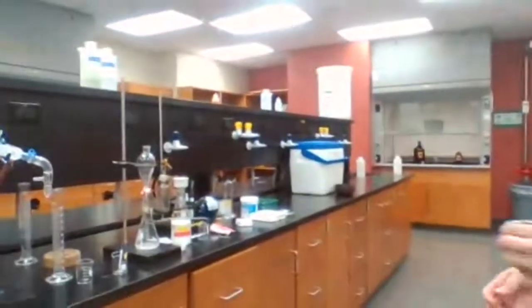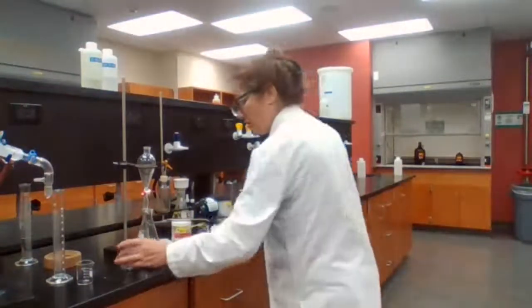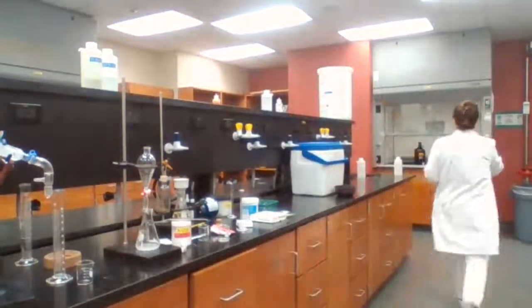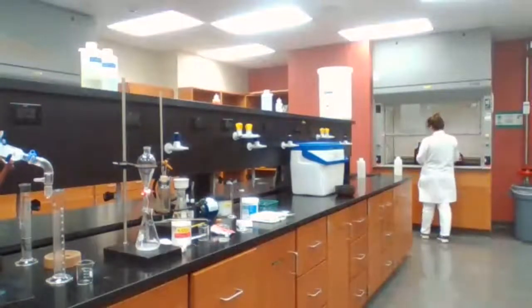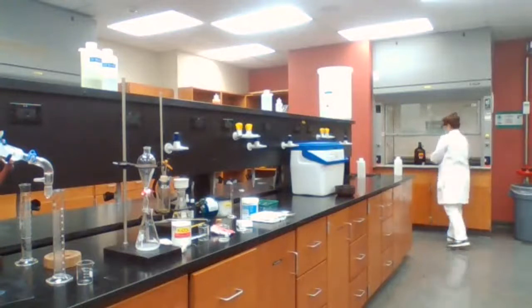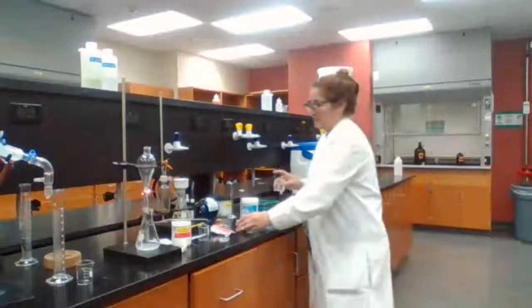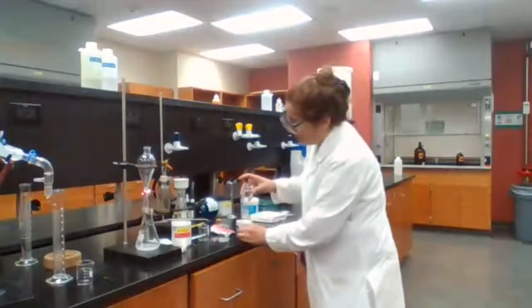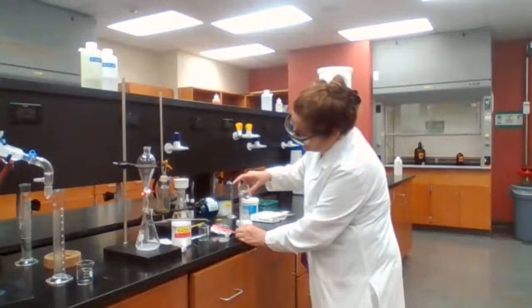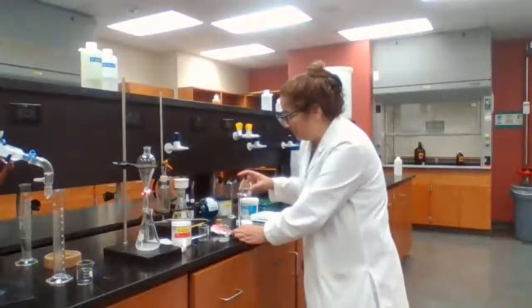Next step, we're going to add ethanol. Bring some ethanol. Going to measure. The procedure is 7.4, right? 7.4 milliliters of ethanol.